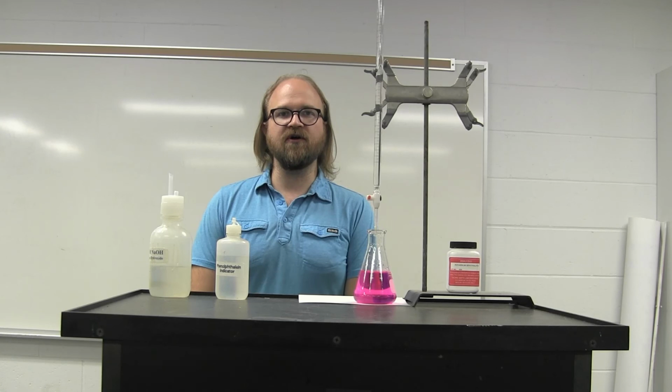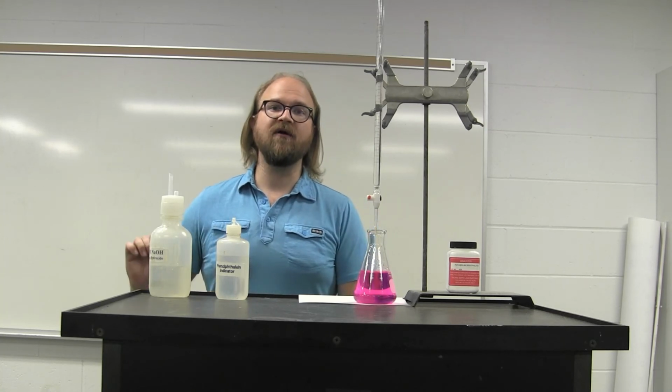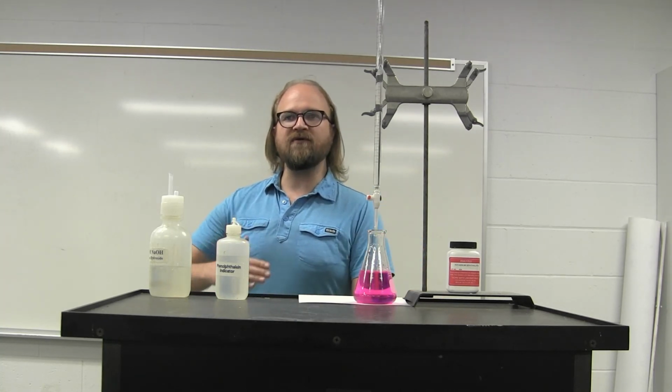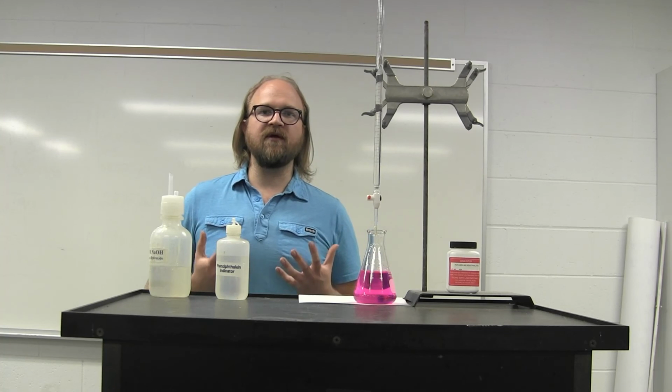From that titration curve, you can obtain a lot of information. The Ka, the acid equilibrium constant, the equivalence points, and use the titration curve to determine what types of indicators could be used to determine where the equivalence points are in future titrations. So these titrations are important throughout a lot of different areas of chemistry where you can use them to solve for unknown concentrations and obtain a lot of the equilibrium information from a titration curve.